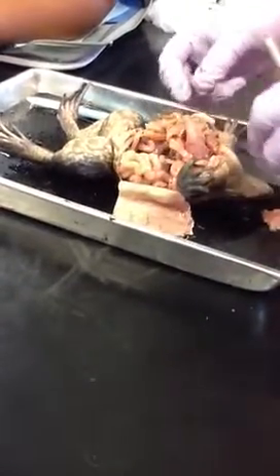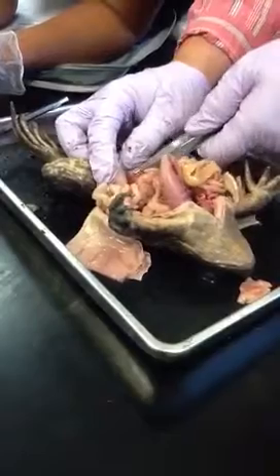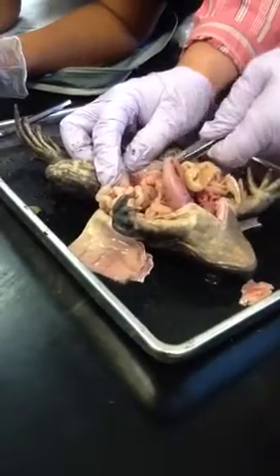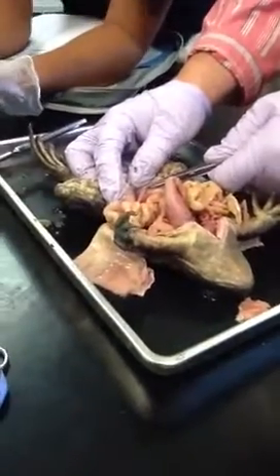These are oviducts here. We saw the gallbladder. We saw the spleen. Spleen is also in this view here. Let's see, is it? Yeah, it's kind of small. That's her spleen right there. Okay, you wanted to see the urinary bladder. If I can borrow these real quick. Okay, there it is. It's a deflated sac. That's the gallbladder. The urinary bladder? Sorry, yes, urinary bladder. Yeah, it's a deflated sac. I saw that.